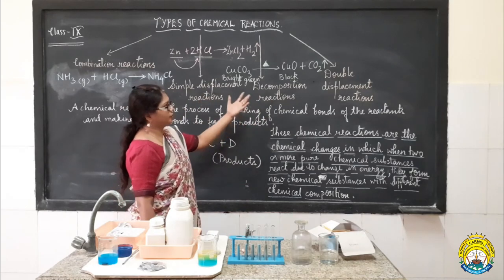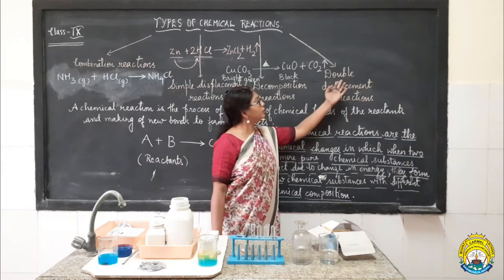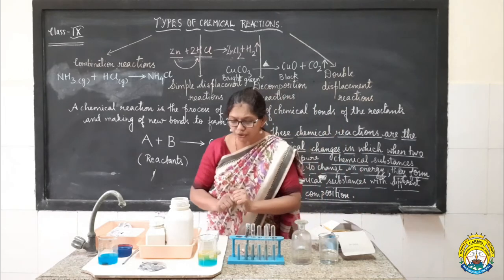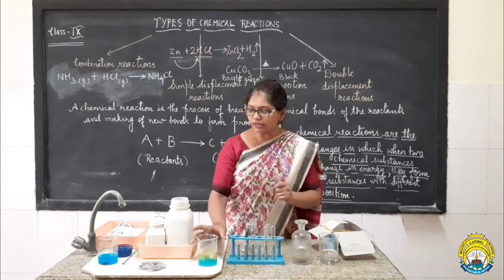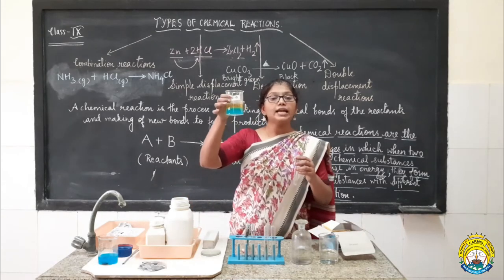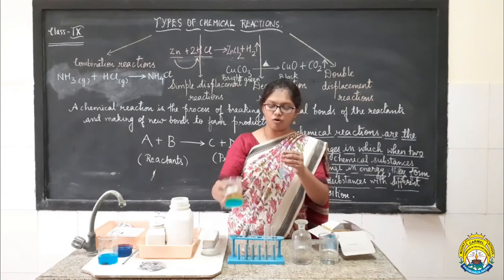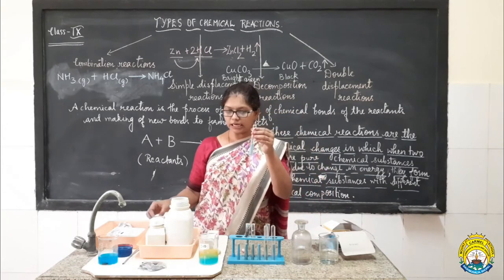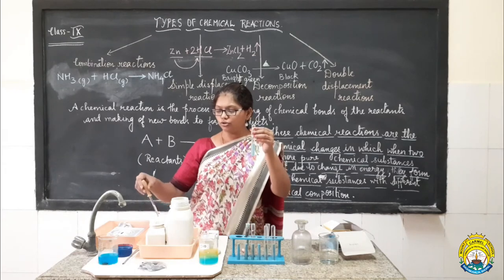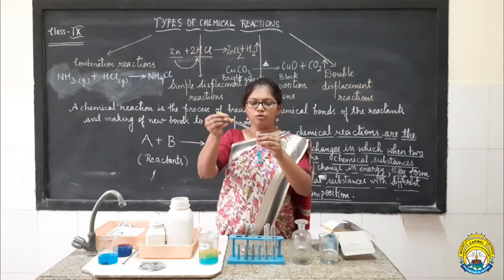Now let us come to the fourth category of chemical reaction, known as double displacement reaction. Moving towards double displacement reaction, I want to show you one more activity to understand how the double displacement reaction occurs. This is an aqueous solution of copper sulfate salt. I am taking a small amount of copper sulfate solution into this clean empty test tube. And now I am going to add a few drops of sodium hydroxide solution to the test tube, and let us observe what is going to form.